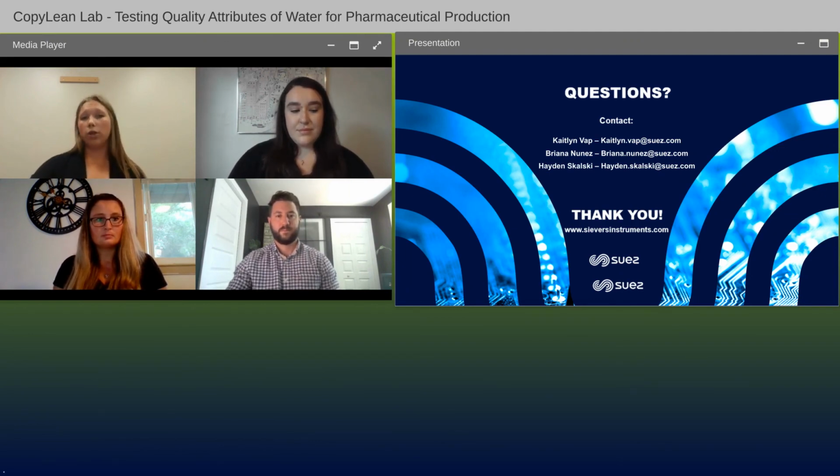And then from an RTT perspective, the guidance document that we had referred to, ASTM E2656, requires that online analyzers should perform equivalent or better than the laboratory instrument. What that means is that the online analyzer must read lower than a measurement from the laboratory instrument at the same time point at which you grab or isolate a sample.